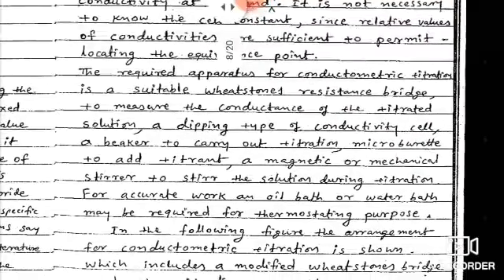The required apparatus for the conductometric titration is a suitable Wheatstone bridge, a resistance bridge to measure the conductance of the titrated solution, a dipping type conductivity cell, a beaker to carry out the titration, a microburette to add the titrant, and a magnetic or mechanical stirrer to stir the solution during the titration.